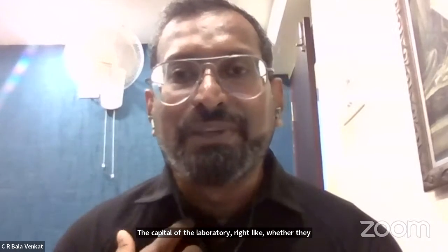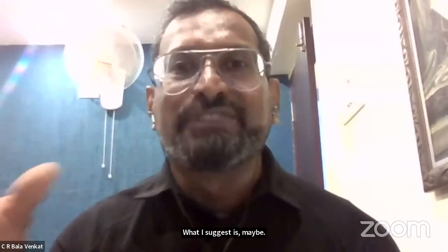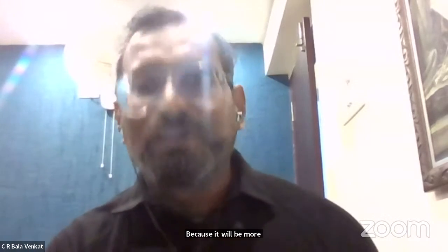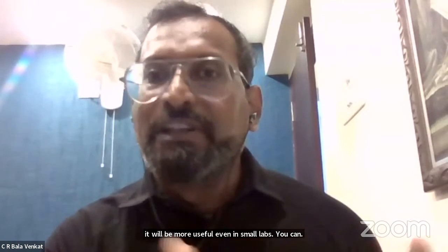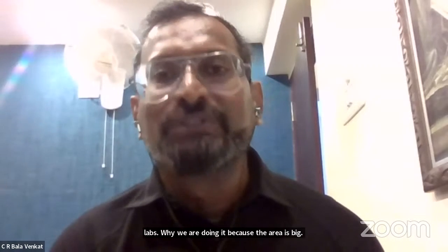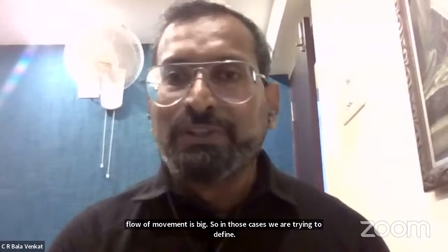What I suggest is that a standardized lab should be a medium sized lab, not a small lab, because it will be more useful. Even in small labs, you can organize it and keep it. In bigger labs, the area is big and the flow of movement is big. So in those cases, we are trying to create a little bit of awareness among the people who are walking in and coming out. So that is one thing.